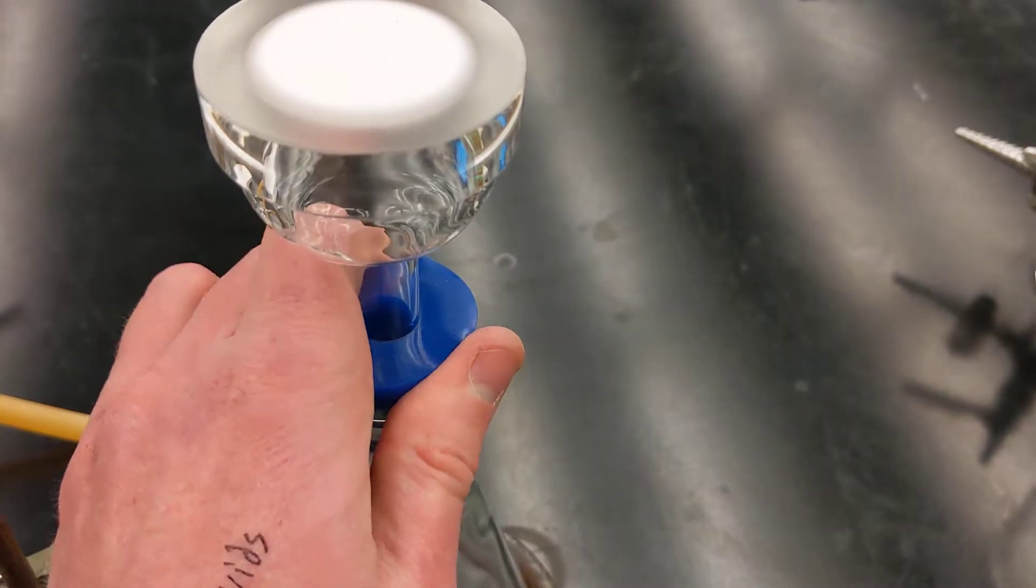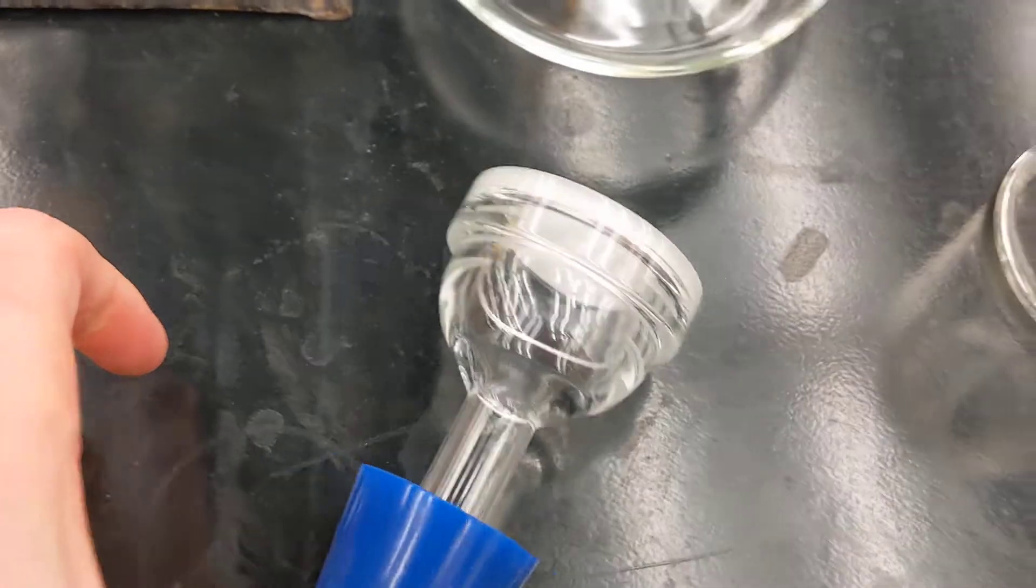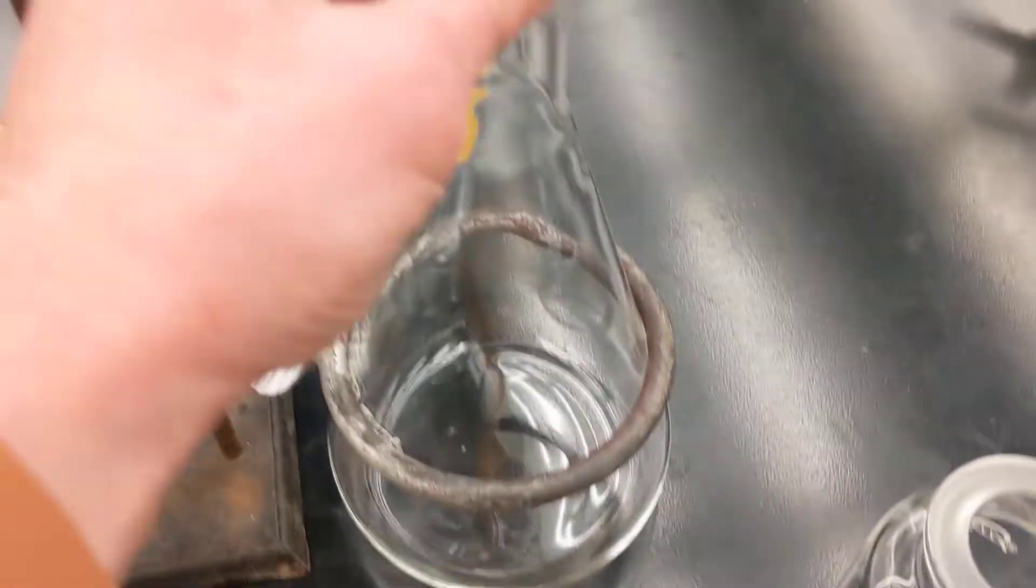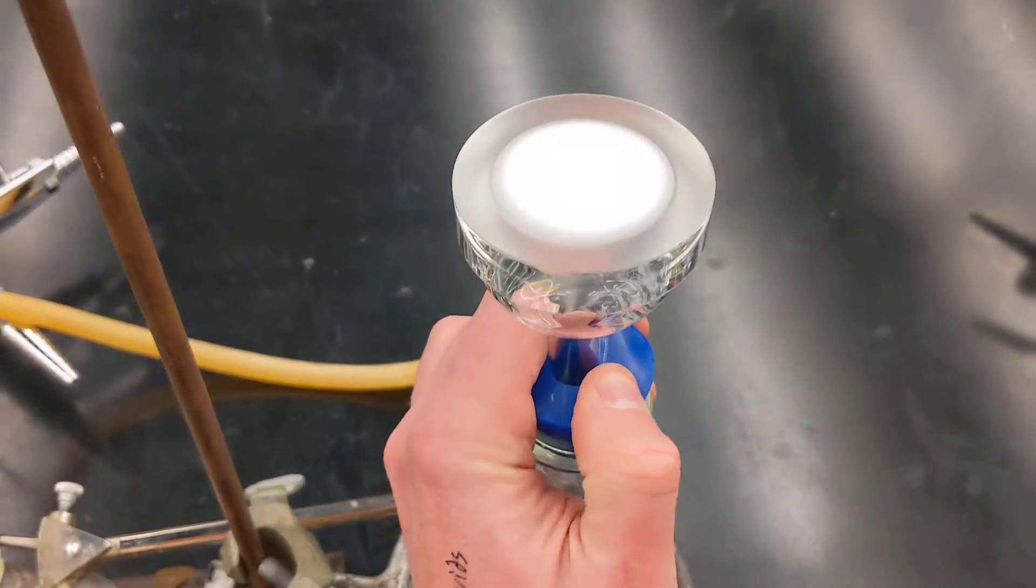So this part comes off here. This is separate. Be careful with this. Don't let it roll off the table while you store it like this. This is what will hold the filter itself. Make sure that's seated nice.